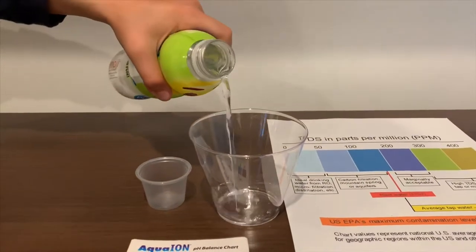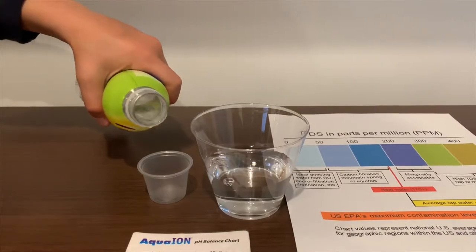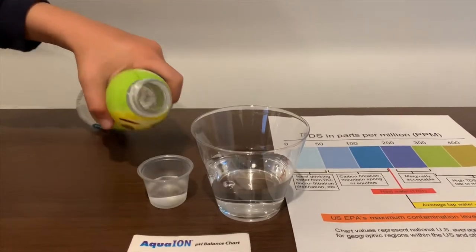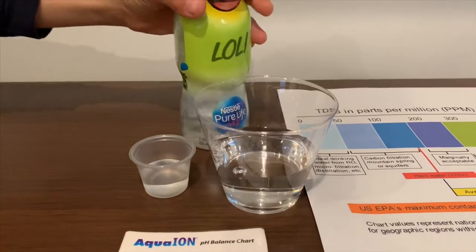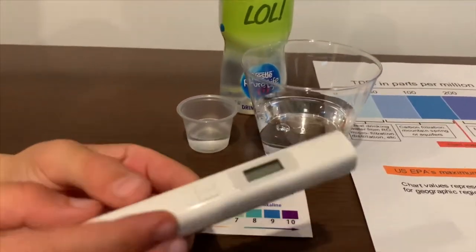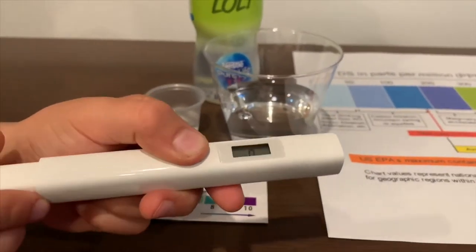Let's pour some water in. First we're going to test the TDS level. If you want to buy this TDS tester, check the link down below. Turn on the TDS tester, make sure it says zero, and put it in.